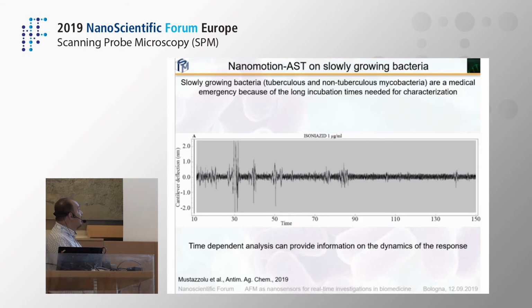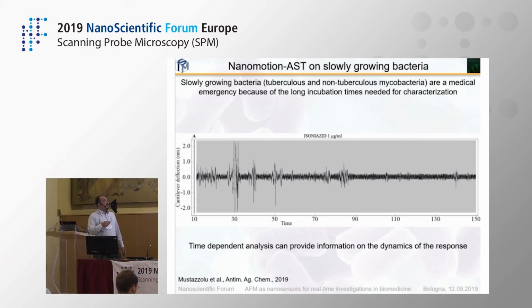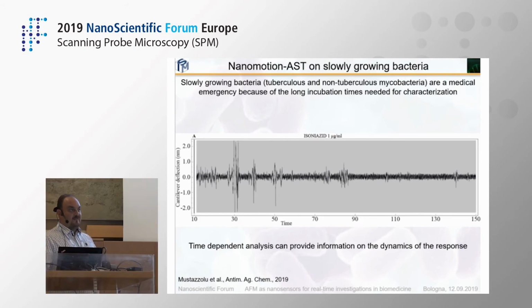And in this case, with BCG exposed to isoniazid, we could see a periodic explosion in the movement, followed by a stop in the movement, in a periodic pattern up to the death of the bacteria, indicating probably that the bacteria grow in clumps, and these clumps protect the underlying bacteria that activate after the external layer has died. And so we can not only understand if an antibiotic has an effect, but also how an antibiotic has an effect.